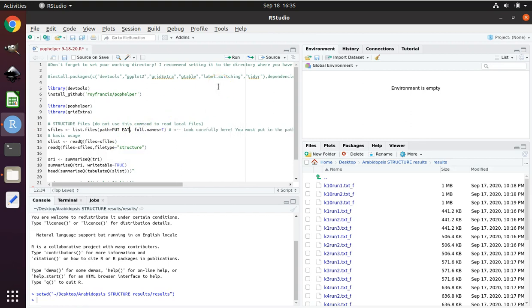Delete where it says Put Path Here. Add a quote symbol. Notice it adds the other quote. Then, carefully keeping the cursor where it is at, on a Windows mouse, right-click, on a Mac trackpad, push down with two fingers, and then choose Paste. Next, save your work so that you don't lose the changes you've made to the script. Click on the picture of the disk.